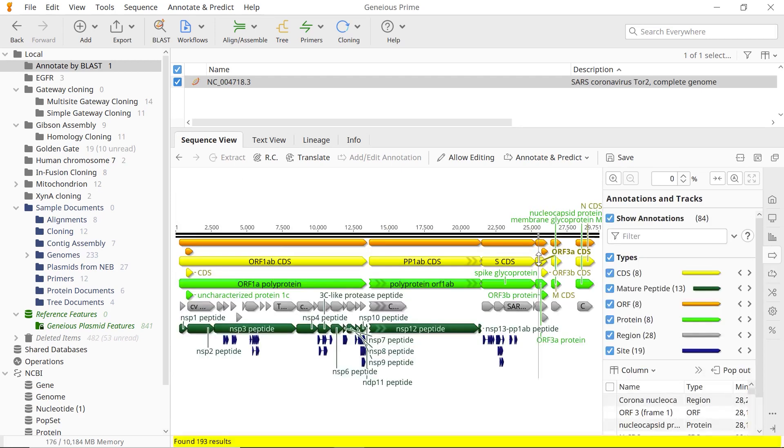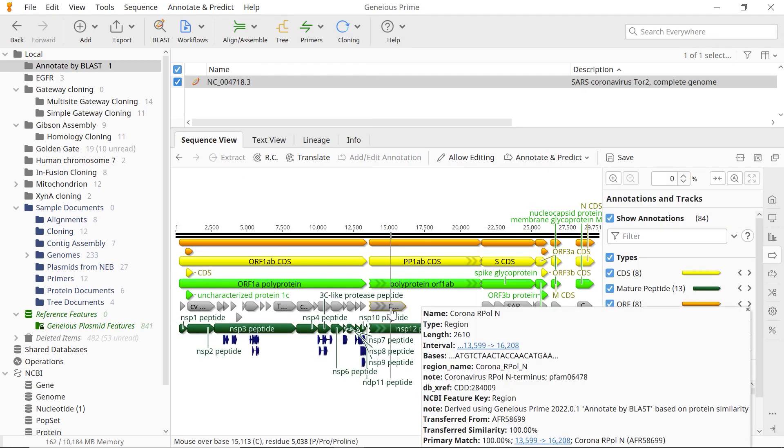When the search is complete, annotations from the BLAST hits will be back translated and transferred to your sequence if they are above the similarity threshold.